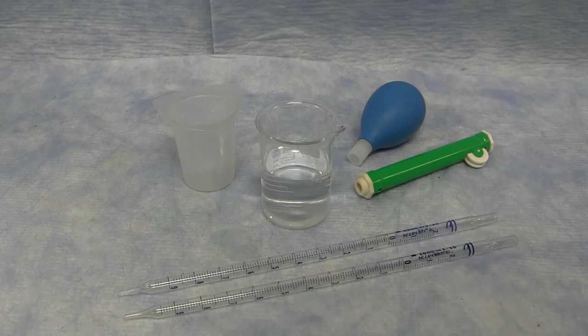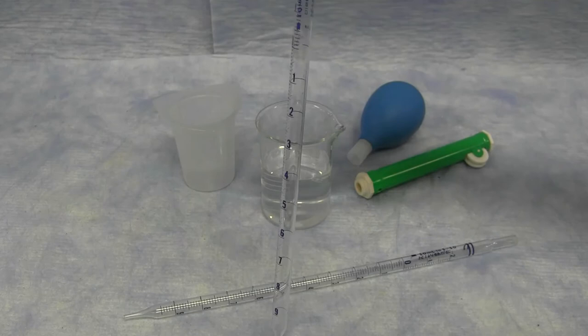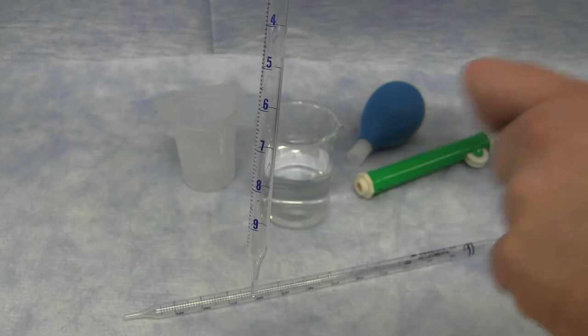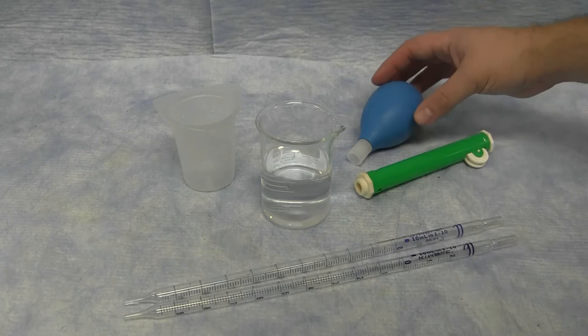Using a pipette to dispense a liquid is similar to using a burette. Both pipettes and burettes are meant to show you the volume delivered from the instrument. The number readings on both the pipette and the burette are read down. This is the volume that is dispensed from the pipette itself. To use the pipette, you'll first need to fill the pipette with the liquid. This can be done either using a pipette bulb or a pipette pump.